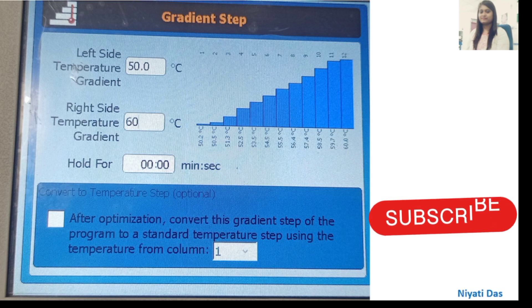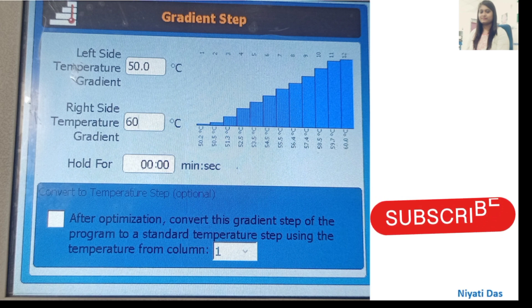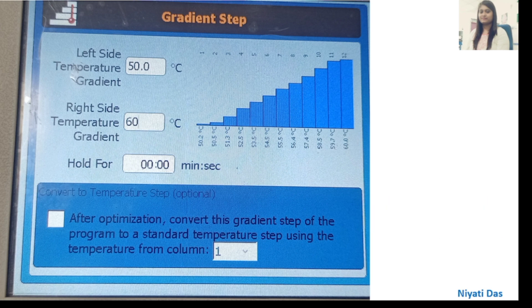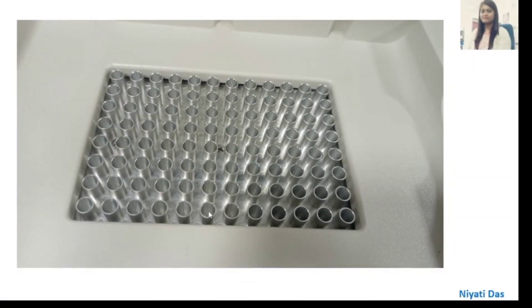After setting up the gradient PCR, the cycler displays the left-side and right-side temperatures. For example, if the left-side temperature is 50°C and the right-side is 60°C, the temperature difference between adjacent columns is one degree Celsius. If we need two- or three-degree increments, we can set that accordingly, and it will be shown block-by-block in the PCR cycler.